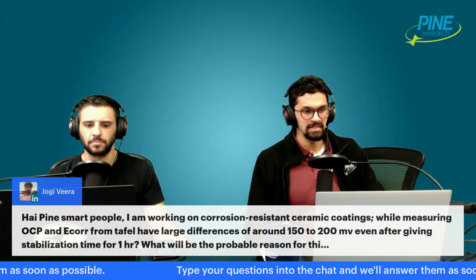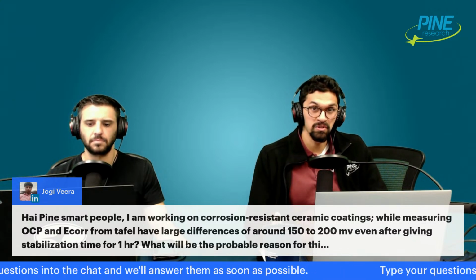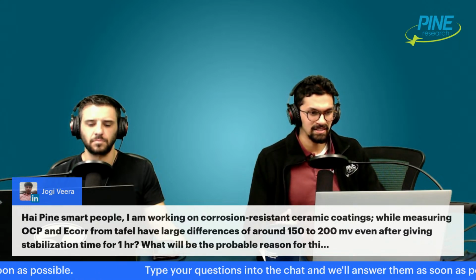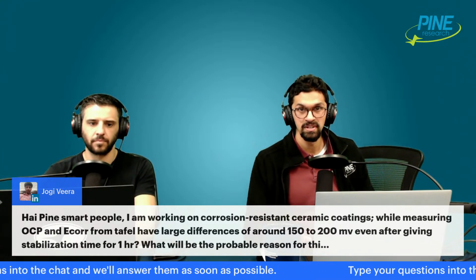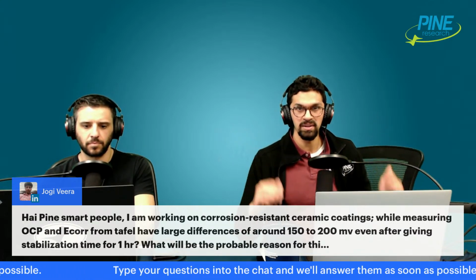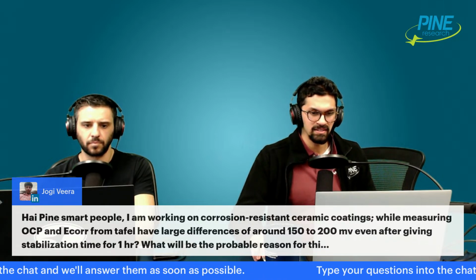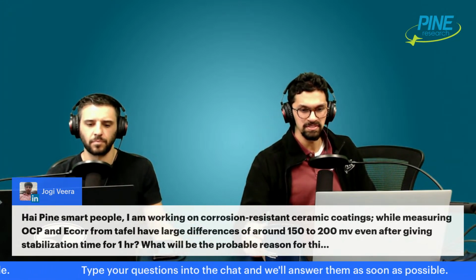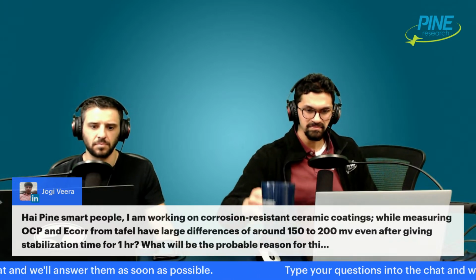But the corrosion potential, to my understanding, is the potential where corrosion is happening, and it's the result of doing Tafel analysis and the intersection between the two Tafel slopes for the anodic and the cathodic branch of the current. So that's my understanding of the system and why you won't necessarily see stabilization after 1 hour.